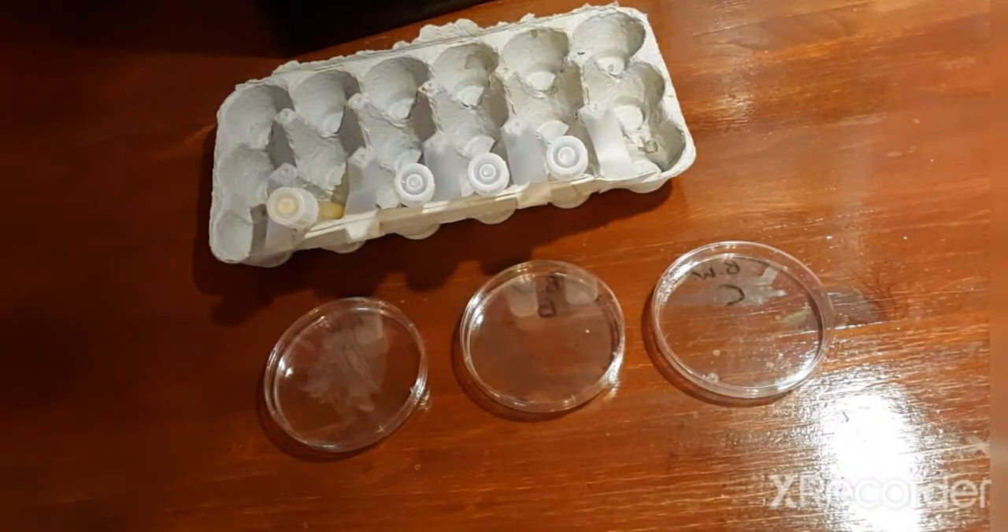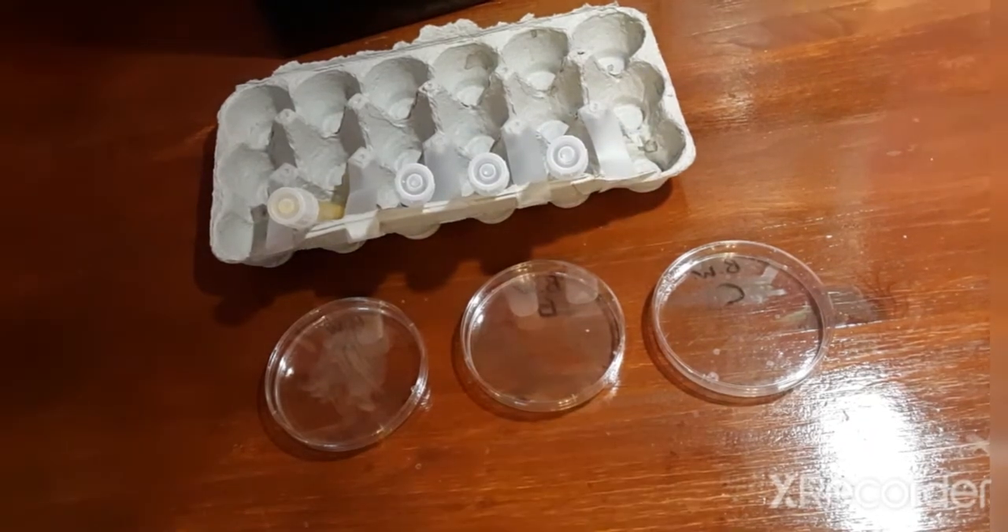Once all contents from each deep have been poured into their respective petri dishes, let the agar solidify before inverting. After that, incubate these three specimens for 24 to 48 hours to allow for colonial growth.